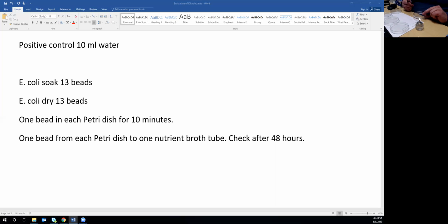Whatever you do, ladies and gentlemen, a common mistake is to have this thing hot and then dip it back into the isopropyl alcohol. I have my students do that all the time. If you do that, you're going to catch this stuff on fire, and now you're going to have a fire on your table. So make sure that the instrument you're wielding is cool before you put it back into the isopropyl alcohol. Otherwise, you're going to catch that alcohol on fire.